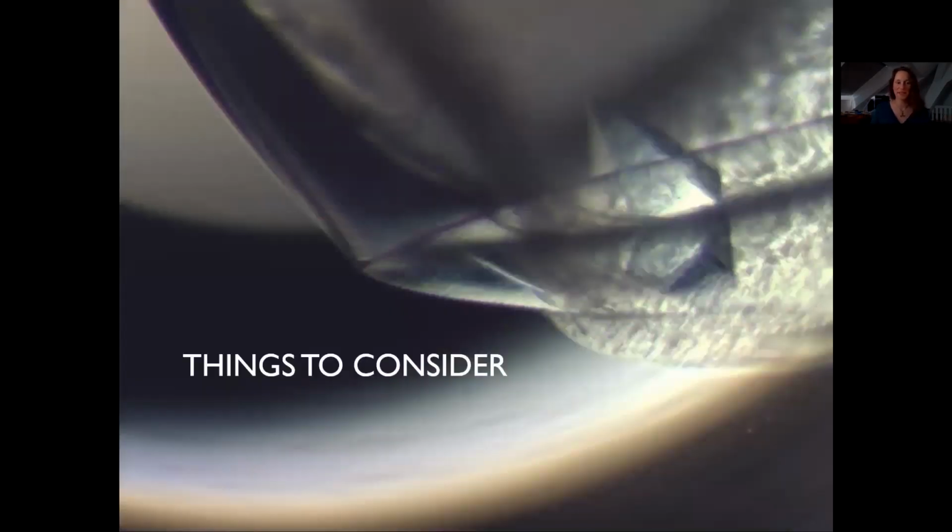Things to consider. By the way, here is another beautiful picture of what can happen to your crystal. Perfectly nice crystal, unfortunately sticking to a thick viscous membrane of precipitated protein. Very difficult to tear open, very difficult to get away with. If you leave it on the crystal, you have half the drop hanging on there, so you can't afford this. You need to get rid of it without damaging the crystal.